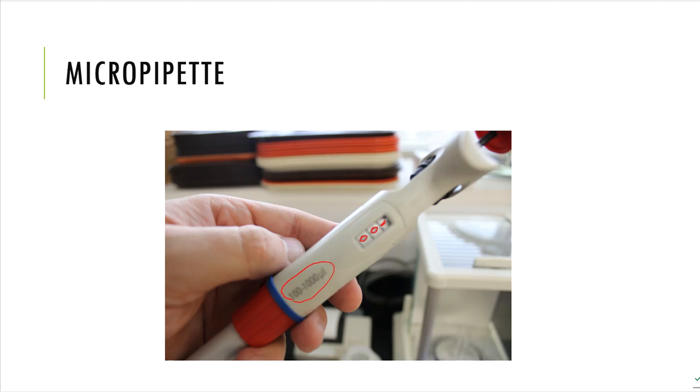We use these for pretty small volumes that we need to add. And 1,000 just so happens to have 4 digits and not 3. So what they decided to do is have your 4th digit down here at the bottom that's kind of hidden. In this picture it's hidden, but they're small little tick marks. So when this says 100, that actually means 1000, which is 1,000. So that's why I dialed this to what I did.